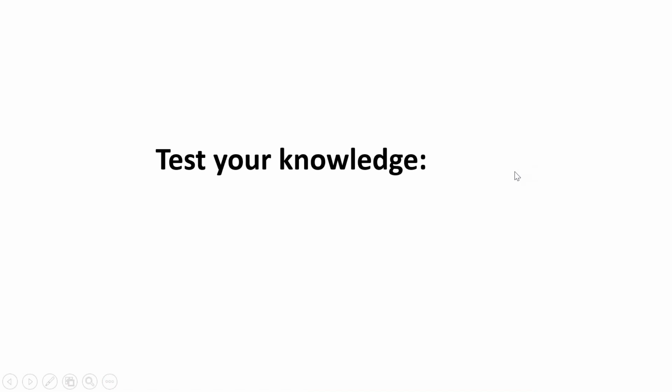Now it's time for a quiz. As a professor, one of the things I have to do is quiz people. And so you're in luck. I have 8 questions for you. Here we go.